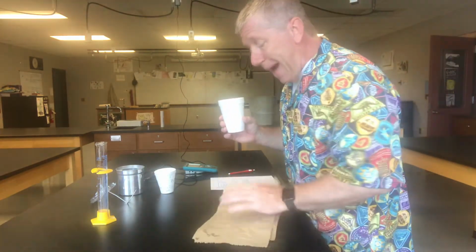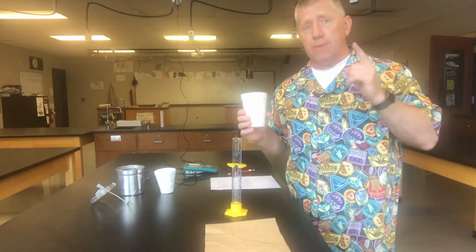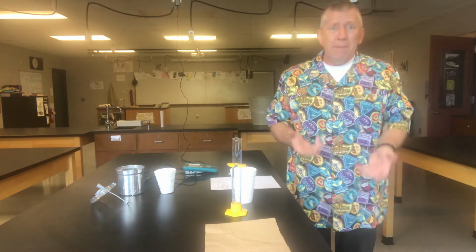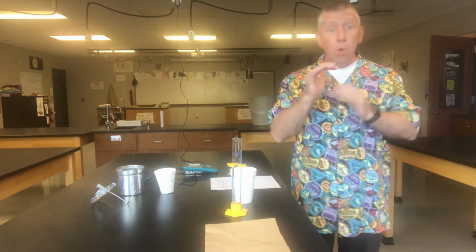So I have to pour this back into the graduated cylinder and read the volumes to determine the mass of the ice. Because remember, we didn't mass the ice, did we? And we need to know the mass of the ice cube. And I didn't put it on a balance. So how are we going to get the mass of the ice? It's already melted. Exactly, it's melted. So now we have more water.